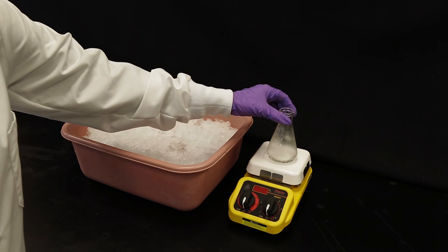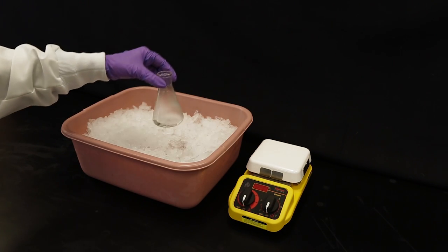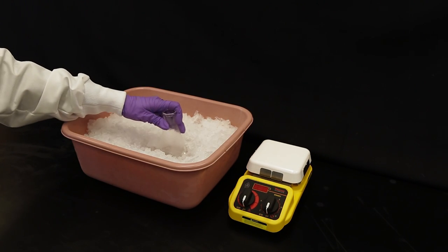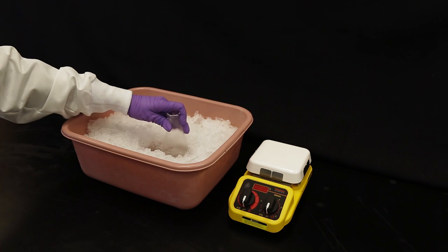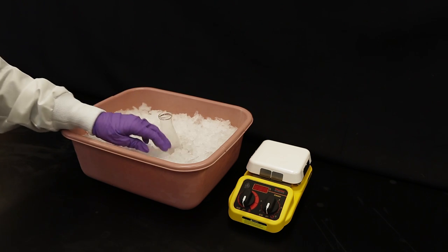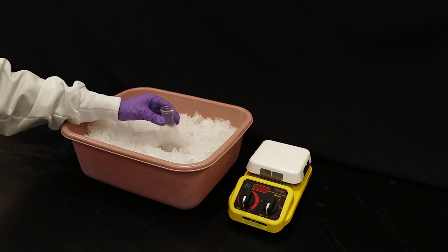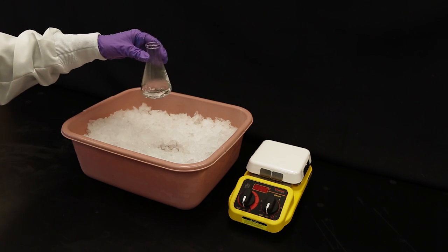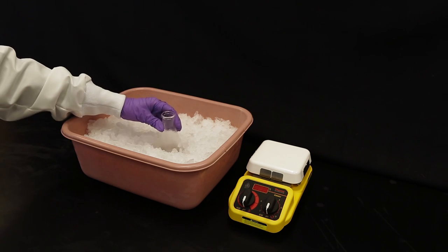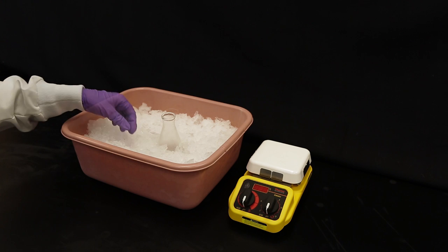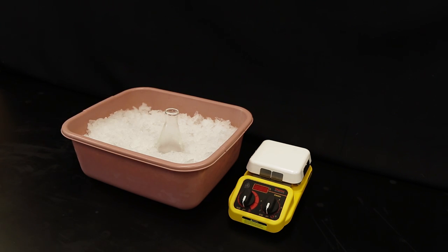After all of the solution has been filtered into the Erlenmeyer flask, transfer the flask to an ice bath. Since the compound was not soluble in the initial volume of room temperature liquid but has been forced into solution by elevated temperatures, the solution is said to be supersaturated. It cannot hold any more compound.